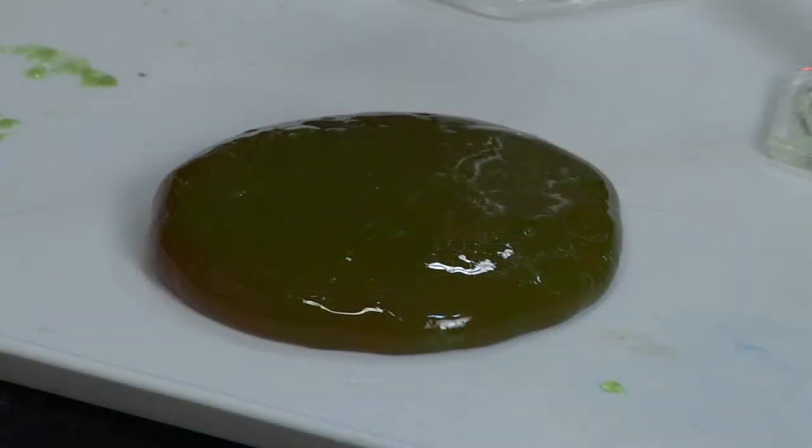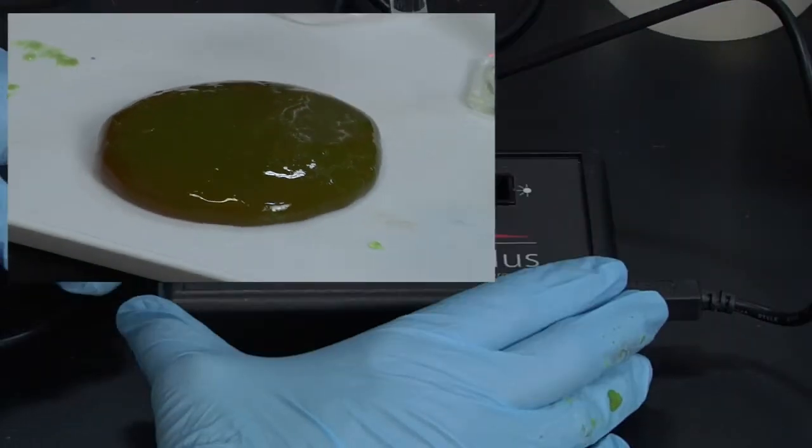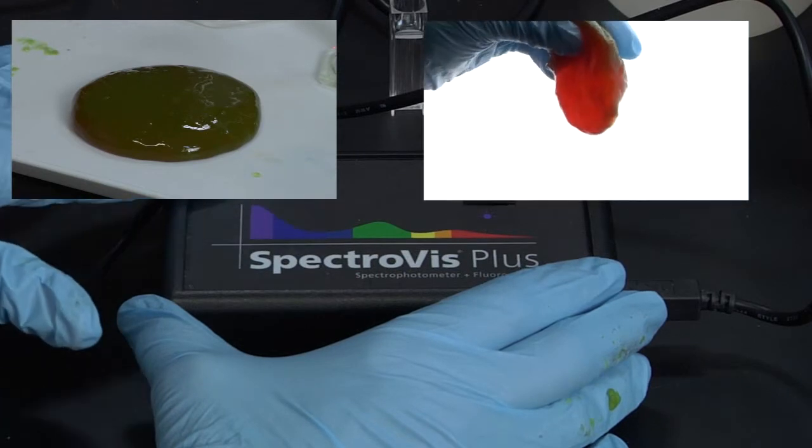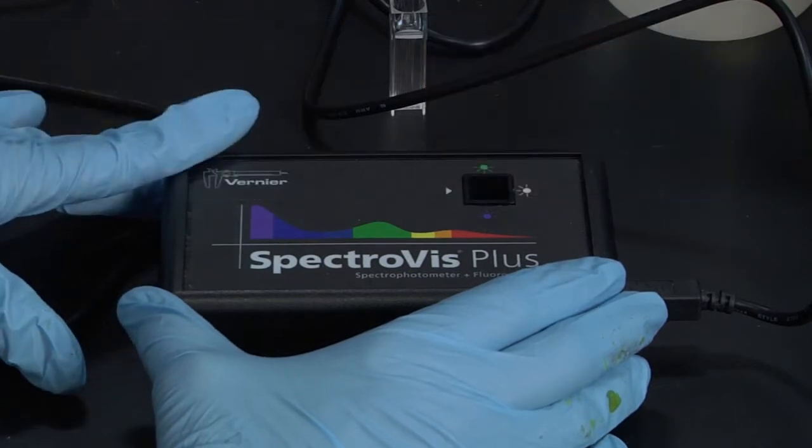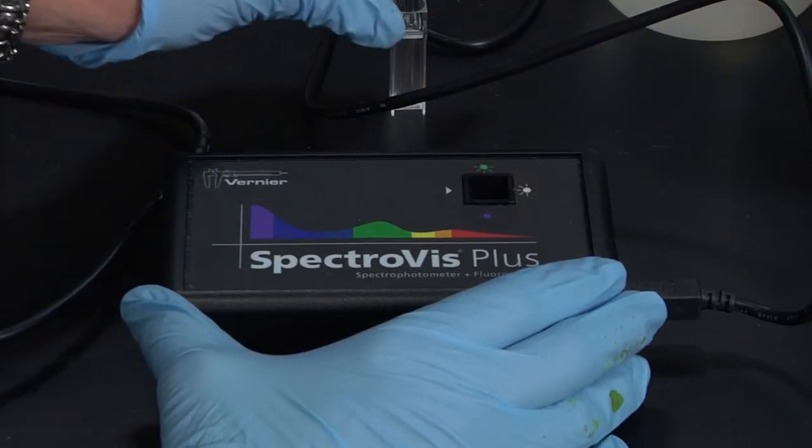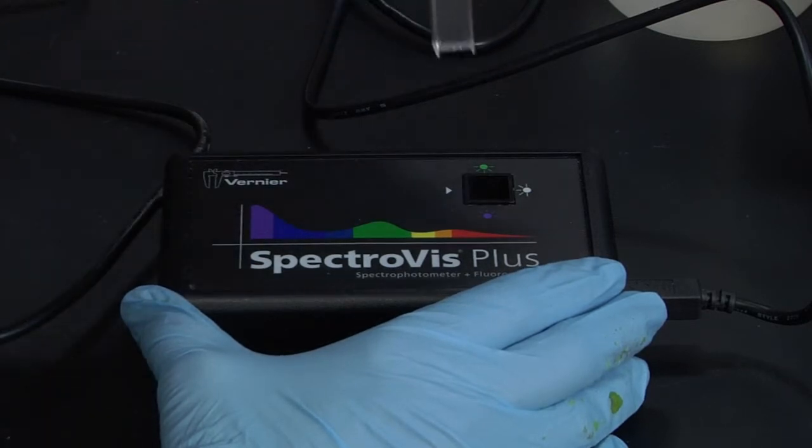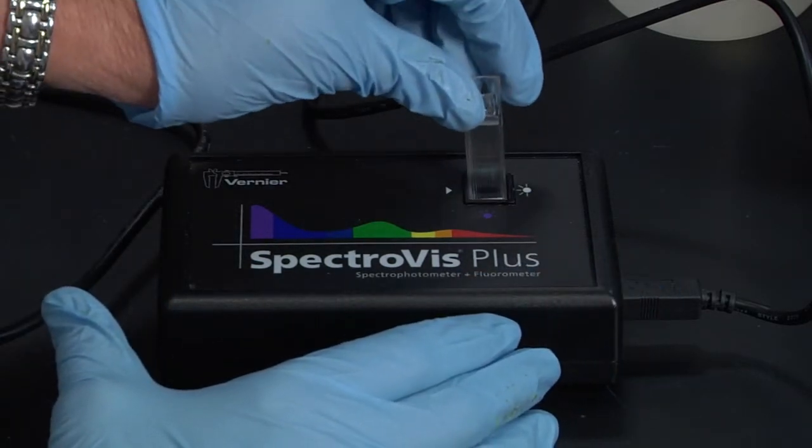So if you remember our slime, we had looked green in one place and then looked red in another. So the way the SpectroVis works is there's a light source here, we have a cuvette, and we put our sample here.